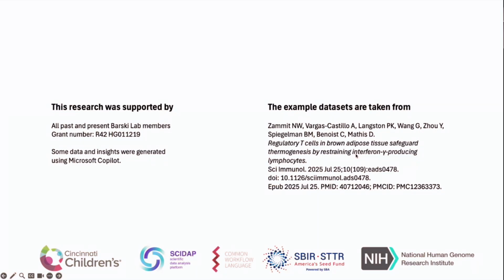I bring that one up for you because it would probably be a fairly easy win to add some more functionality for people that are quantifying their data in a slightly different way, and it would be very easy to import. There's a package called tximport that will essentially convert those data sets to raw counts that can be used through DESeq2. Very, very simple. So that might be something worth considering.